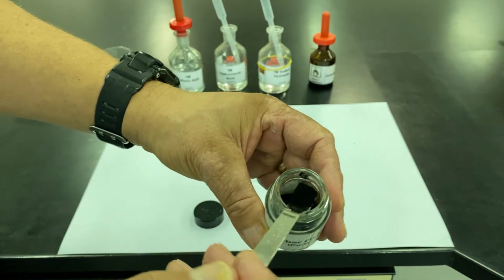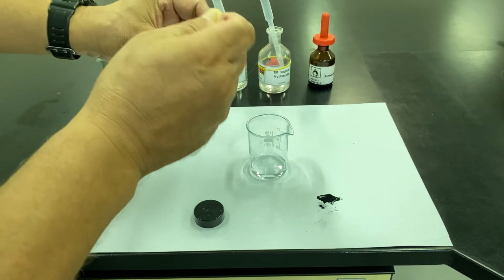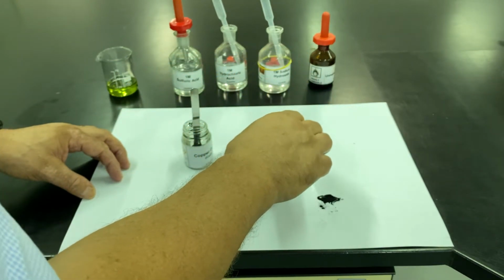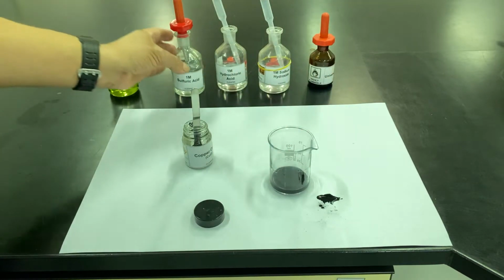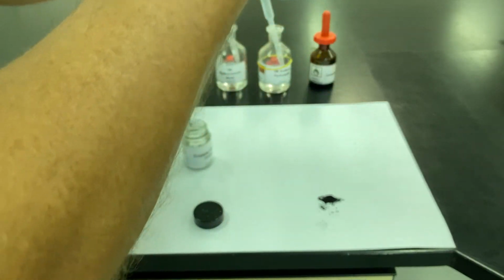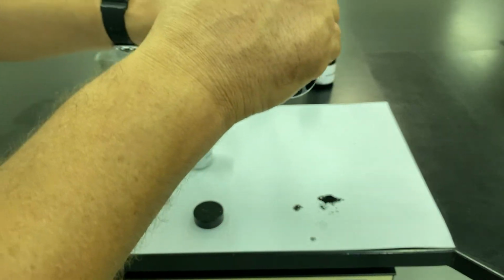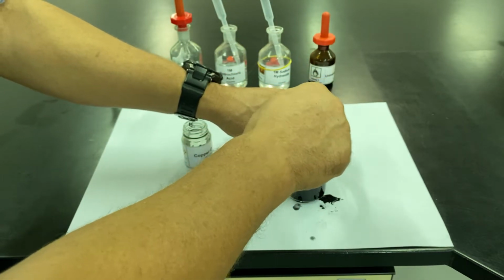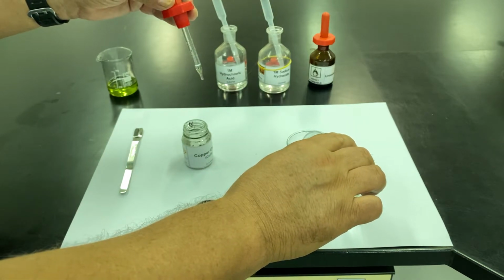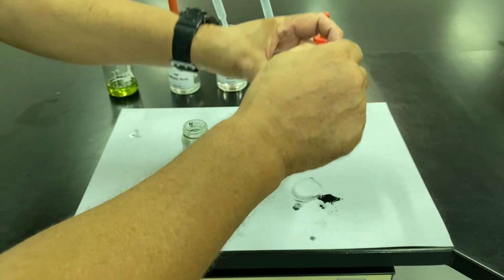Okay, and the copper oxide is a black powder. Hope you can see that there. That's the colour of the copper oxide. Now if I pour and mix in, okay, the black copper oxide, let's go big with the sulfuric acid. Now if I give that a good stir, right, now we've definitely got an excess it looks like, of the copper oxide.